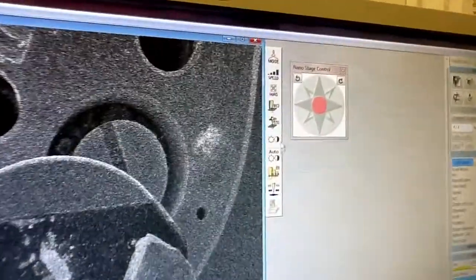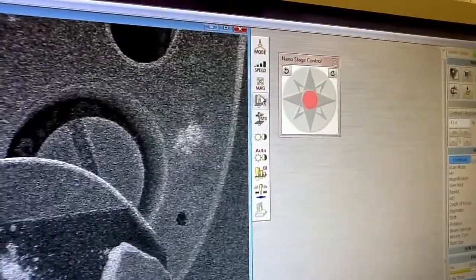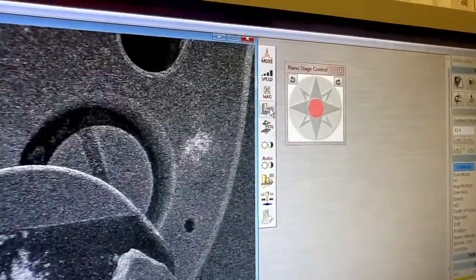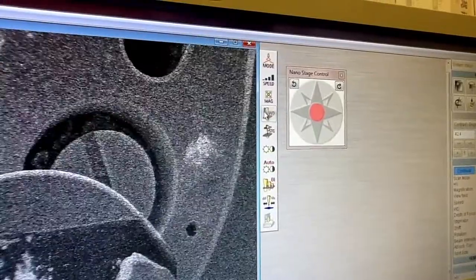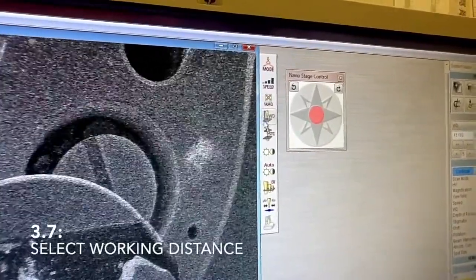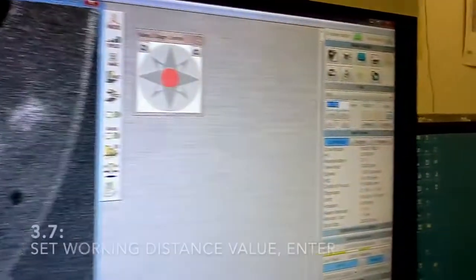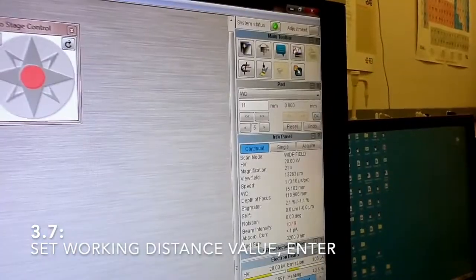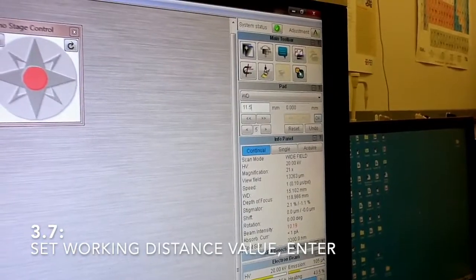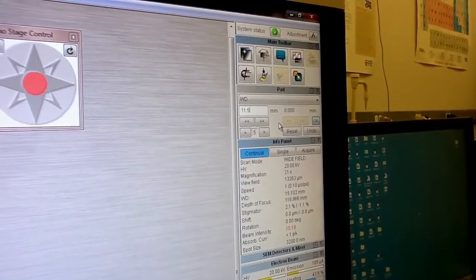Next thing is to select the proper working distance for your imaging. Just press this working distance button and type 11.5, then press enter.